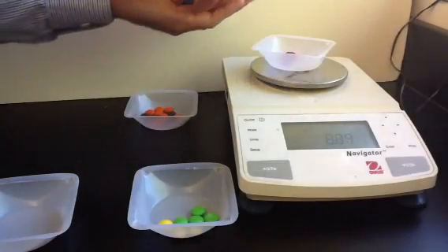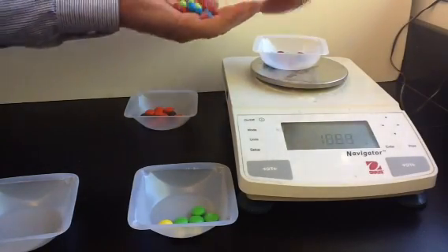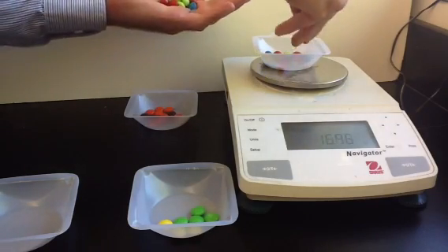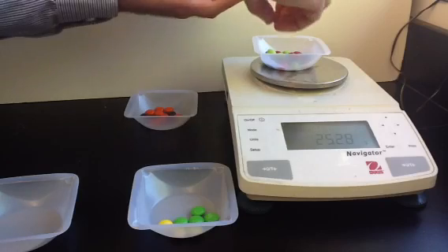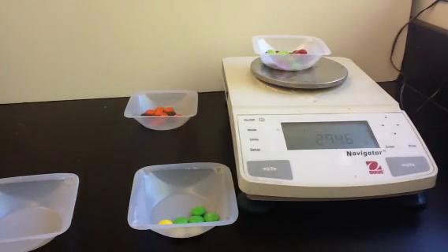So we have 3, 16, 19, 22, 23. We have 27 Skittles. So 27 Skittles in our mixture here, and they have a mass of 29.46.